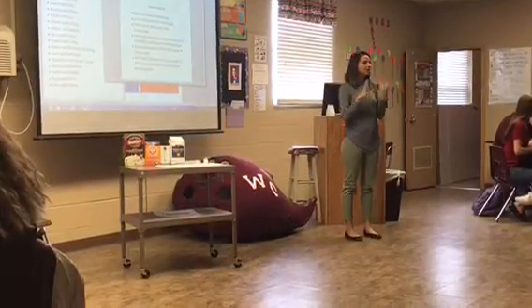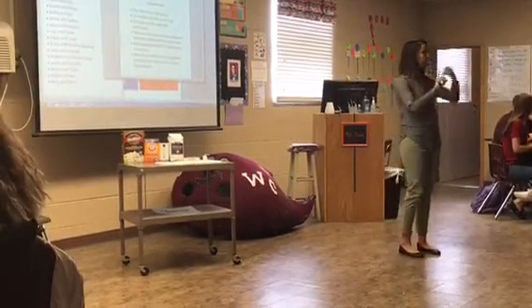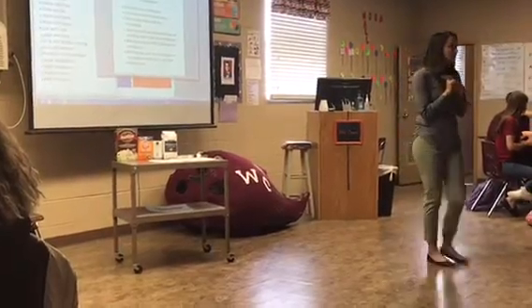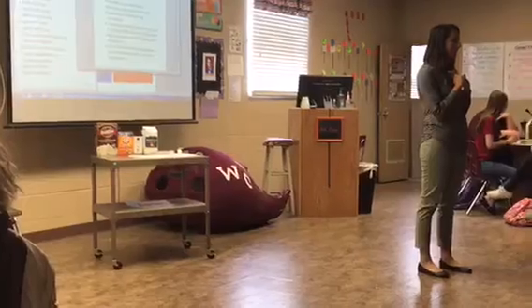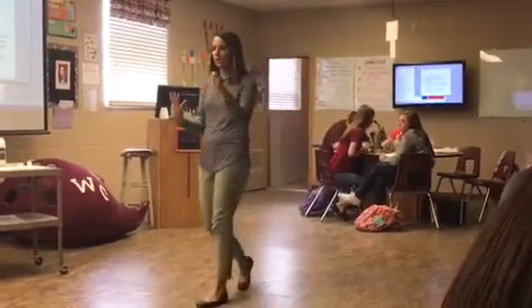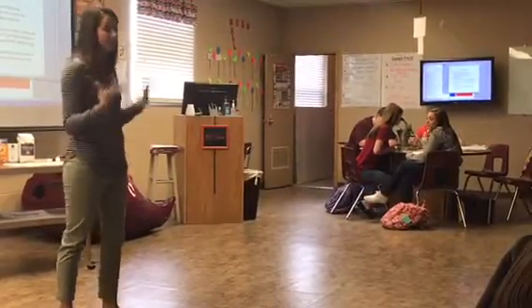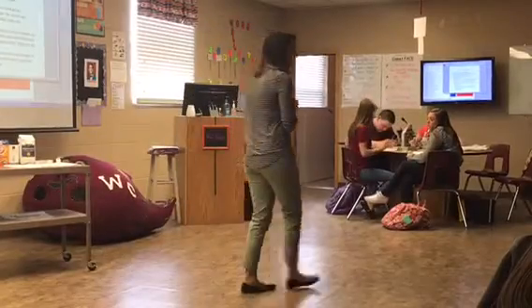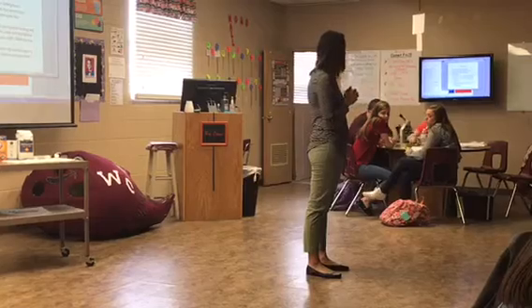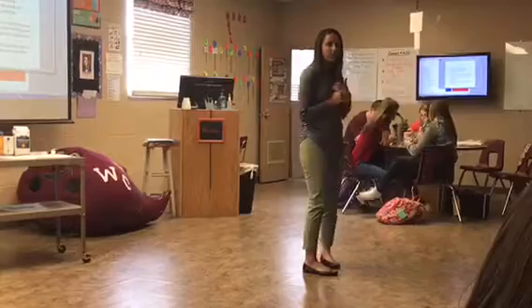So let's not talk amongst other tables, so keep the talking at your table group. Make sure you're using the microscope correctly. You're only looking at the slides under the microscope, okay? You're going to take turns with your partner. So they're going to look at the slide, you record your observations, and then trade off with your partner so they can do the same, because everybody has to have their own data sheet, okay? And then after it's all complete, we're going to return the microscopes back when we're done, okay? All right, go ahead and get started. If you need help or have any questions, raise your hand.